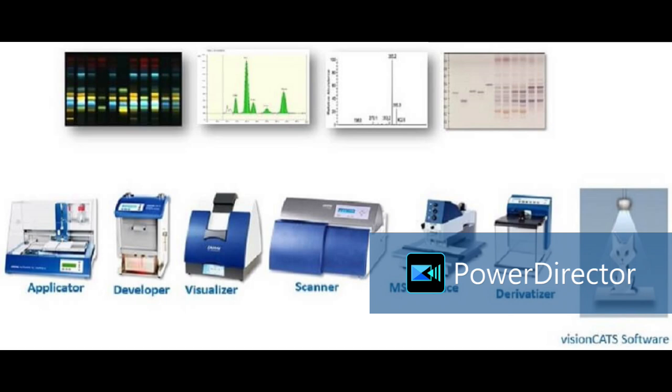In forensics, they have also recently published on nerve agents, the nerve agents used in chemical warfare. Those active on cholinesterase, they have developed a method for those nerve agents. I will show you that method also. And on the Anchrom website, you can make your login and download different methods. I'll show you that cholinesterase work in between, just for a change.